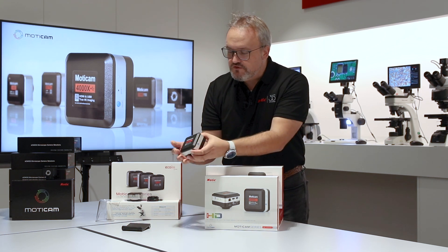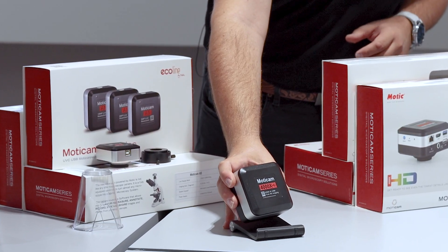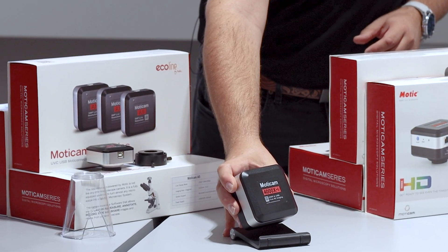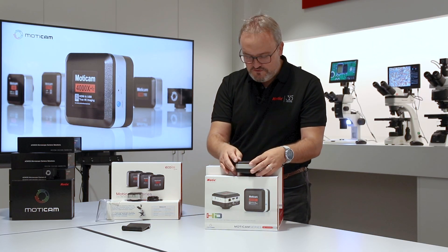Here we have the Moticam 4000X, which has Wi-Fi, HDMI, USB, and micro SD card outputs at the same time. We also have just the wireless cameras such as the X5 range.